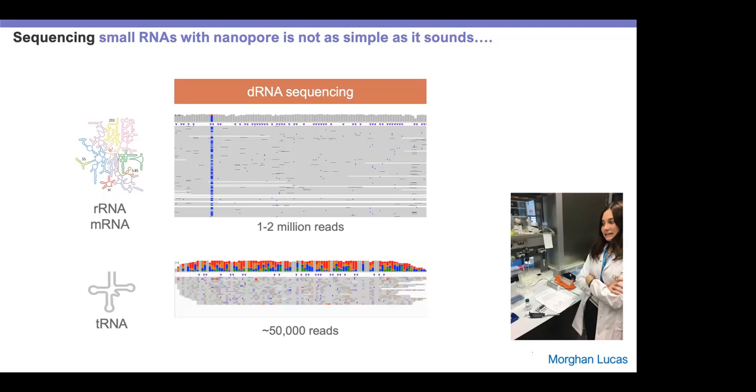Like you see in general, the algorithms improve. So the base calling is not that bad. Maybe this could be a pseudouridine modification, for example, right? But in any case, it looks reasonably good, with some insertions and deletions typical of nanopore long reads and so on, right?